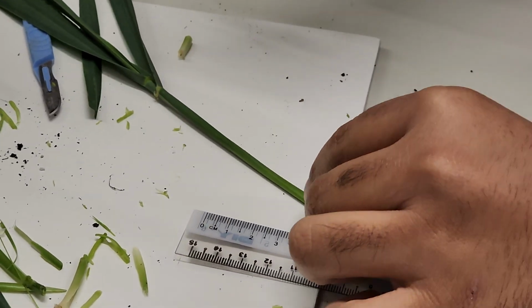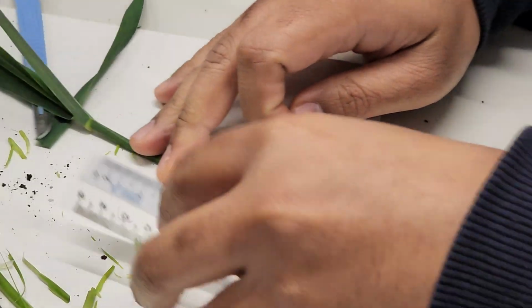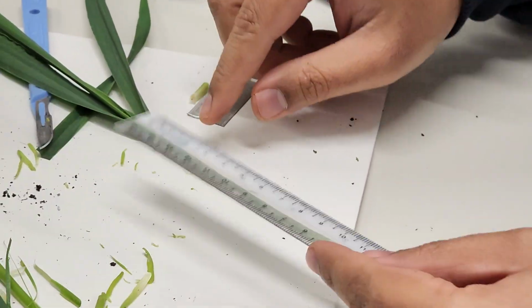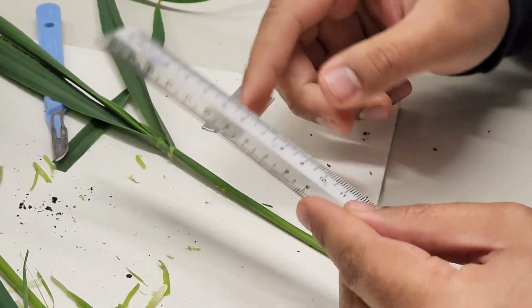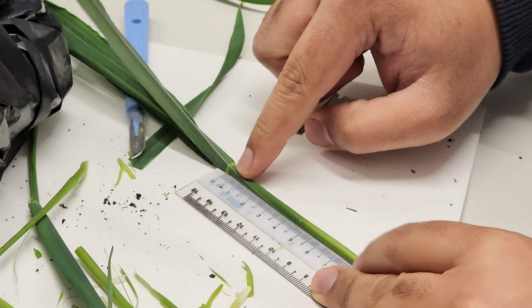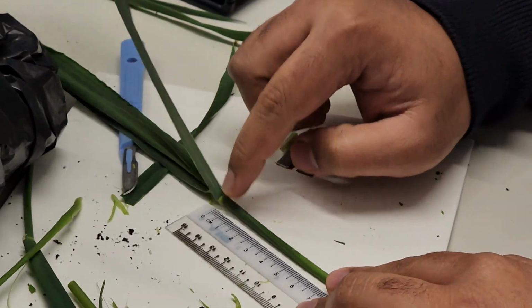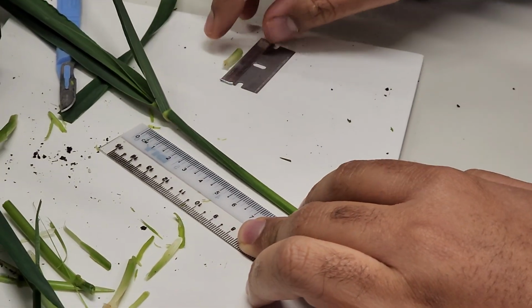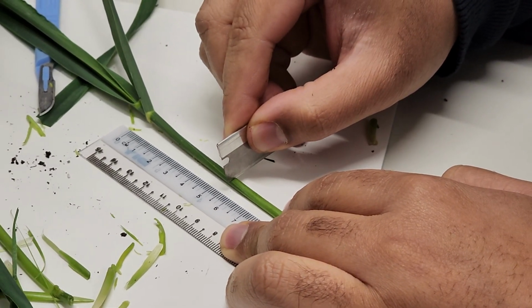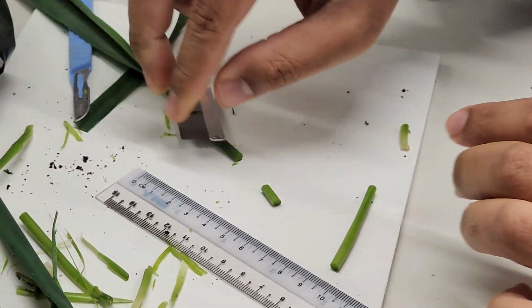And we'll take the mid section of the stem. You know what? Let's be certain. So that's 1 centimeter, right? Yeah. This is the top because that's the beginning of the collar. It's 11, 12. So 12 divided by 2, around 6. So that's the region here. We take about 0.5 from there and 0.5 from there. So this is the midsection of the culm.